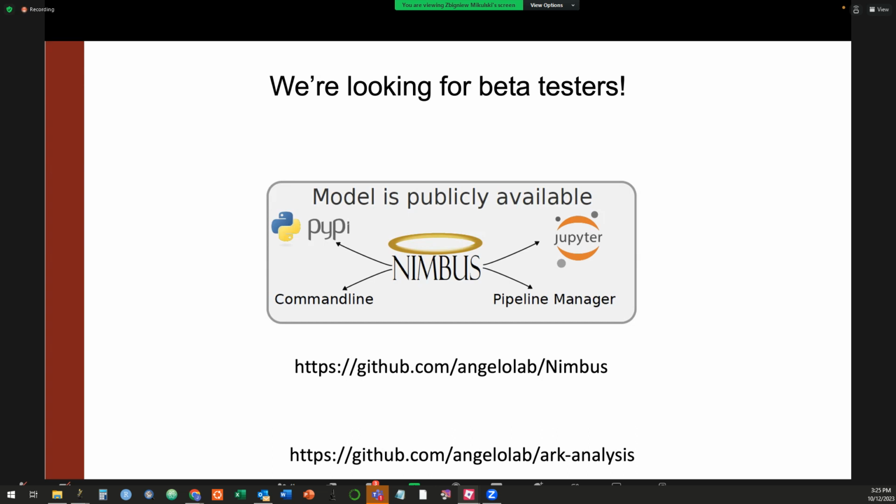Yeah, so we did not include any imaging mass cytometry or CyTOF data in the data set for Mesmer, where we had a similar problem of different resolutions. We just have a parameter that says, would you like to rescale your data? It's really easy to upsample CyTOF data so that it looks more similar to 20x fluorescence. And we found that that is super robust for segmentation. We haven't tried that yet on this, but I imagine it would similarly work.